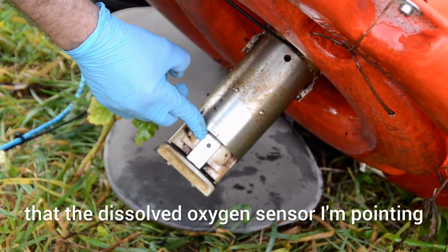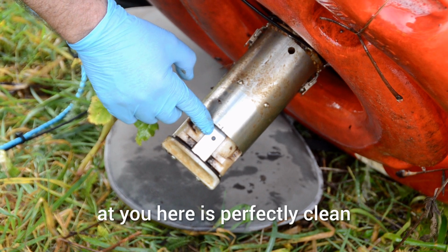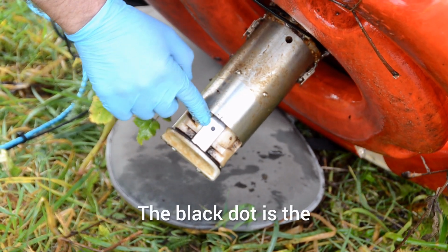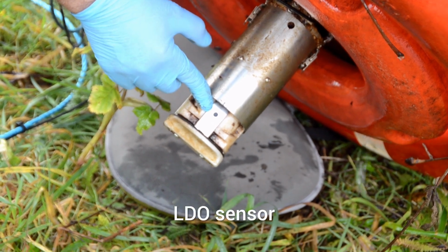But you can see that the dissolved oxygen sensor I'm pointing out to you here is perfectly clean. That's because it's wiped and cleaned every 30 seconds. The black dot is the LDO sensor.